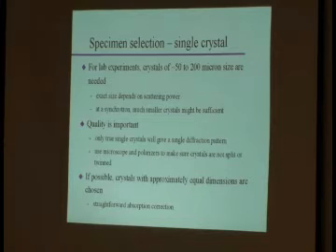Now, so size matters in the lab. If you have access to a synchrotron, size is no longer as crucial, okay? But what else is important? Well, the quality of your crystal is actually really important, never mind whether you go to a synchrotron or to a lab source. And this statement seems almost trivial, okay?